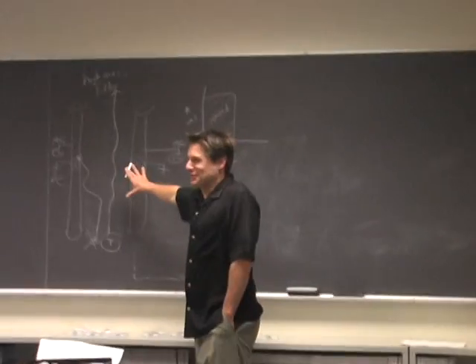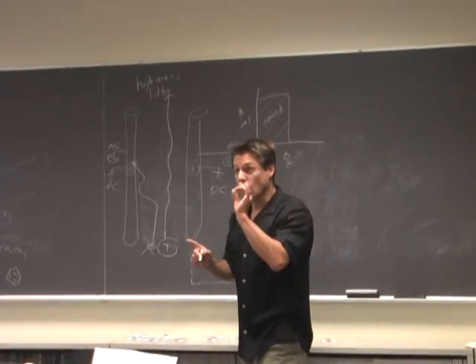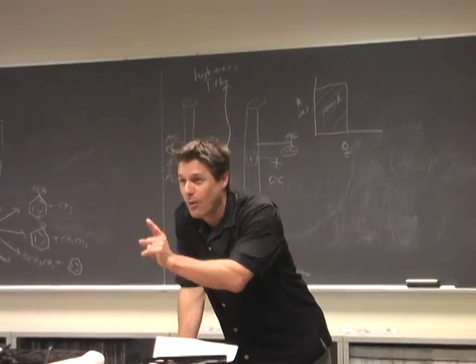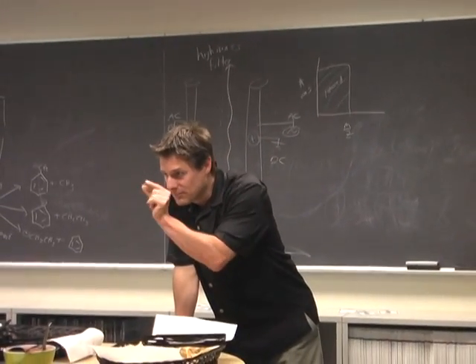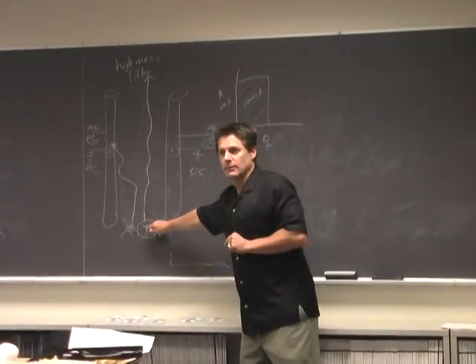That's just half the equation, unfortunately. Now we got the negative rods. Our goal is to only allow one mass unit through, the smallest window as possible. So I need something that's going to filter out the big one.